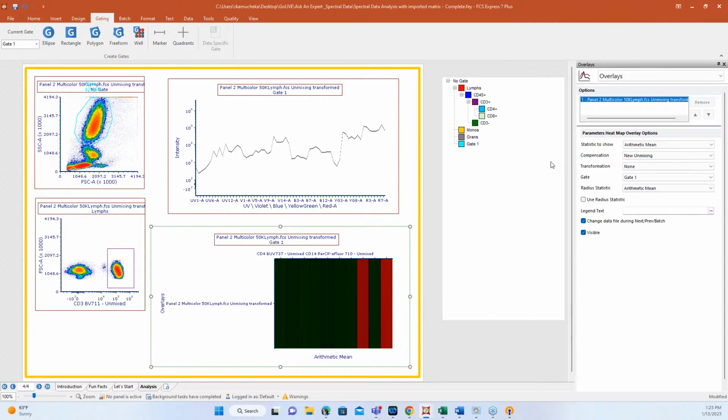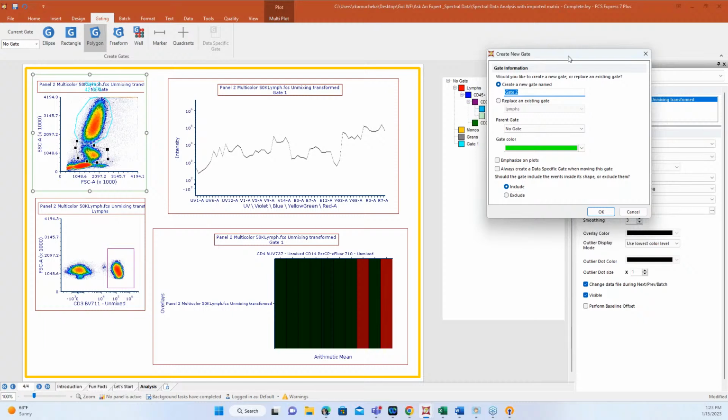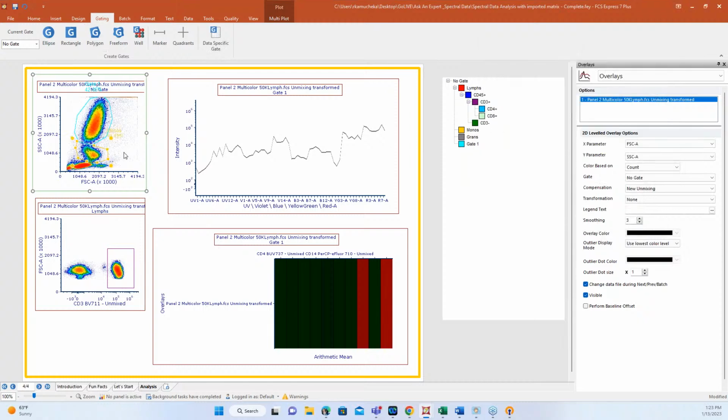So I guess I have just a little bit of disconnect. I might have been working with the unmixed file or a different data set that didn't have this unmixing transformed thing here. So when I created these gates, I just needed to update them. Of course, with our gates, you can replace a gate. So if you do run into something like this, like I did my initial analysis on an unmixed file, and then I'm moving to a raw data file because I wanted to compare how the unmixing looked between the instruments or something else, you do have that flexibility to just replace gates as well.